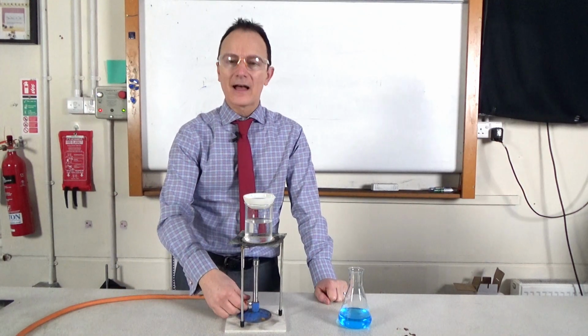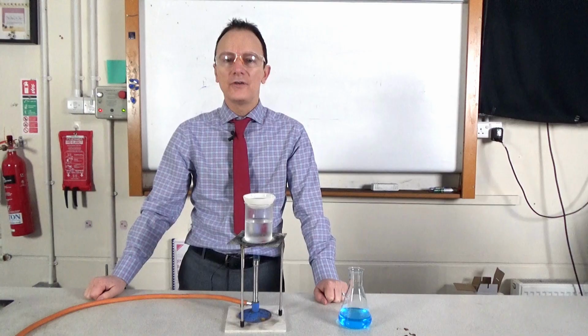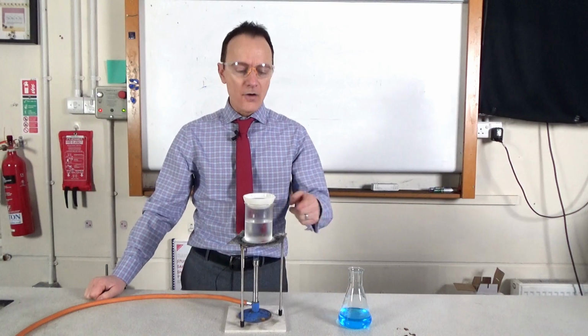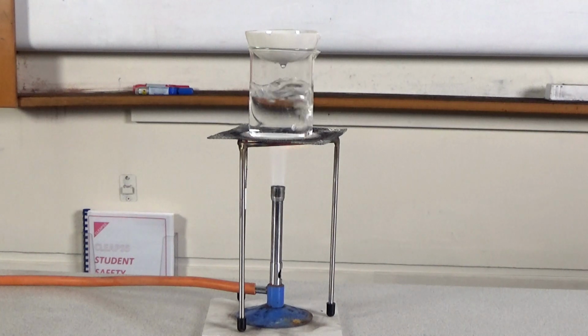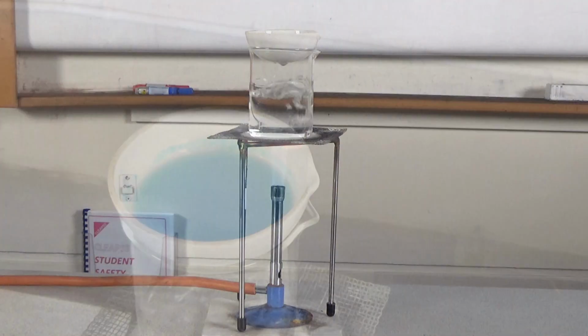So remember in an exam to say you would heat up the solution in an evaporating dish over a water bath. We keep heating the solution until half of the water has evaporated from the solution, or until we start to see crystals appearing around the edge of the evaporating dish. What we don't do is evaporate all of the liquid.